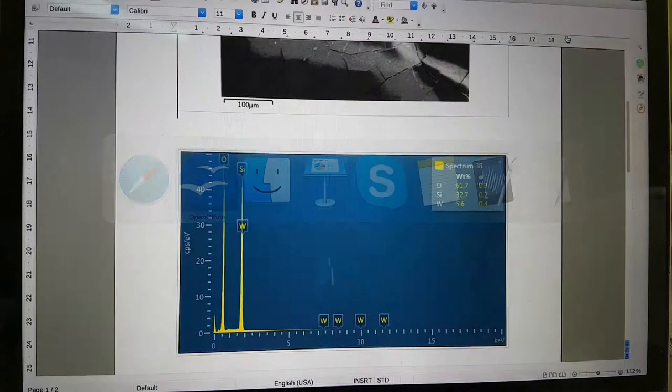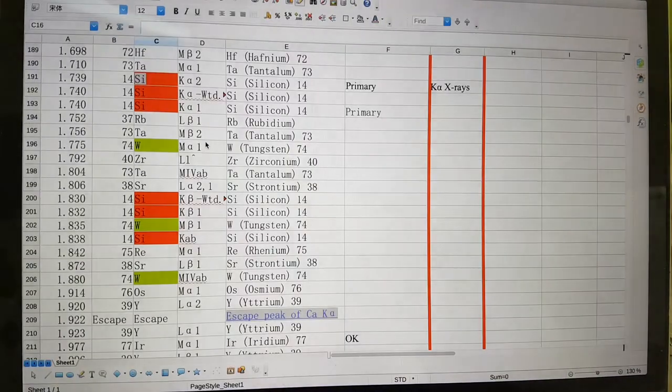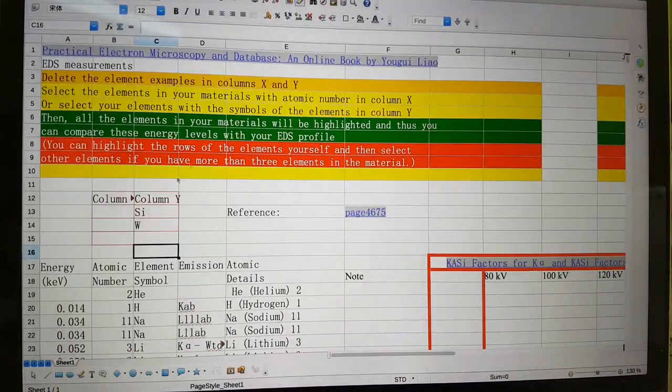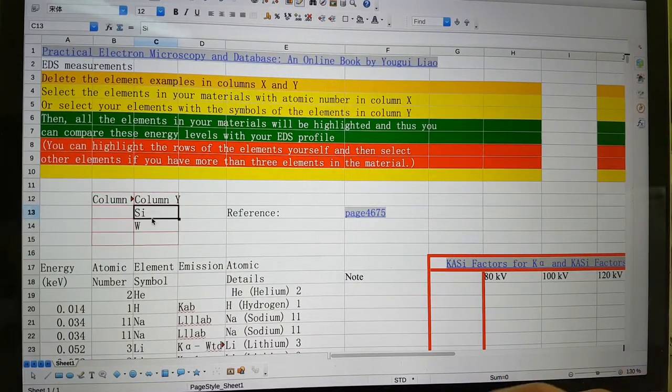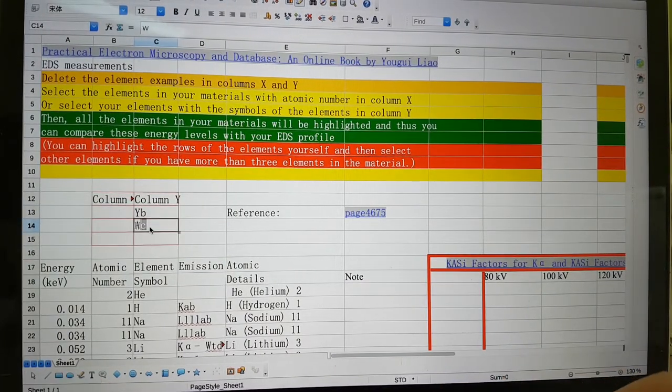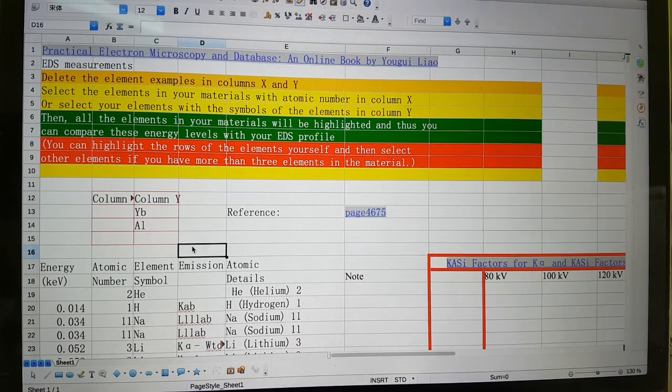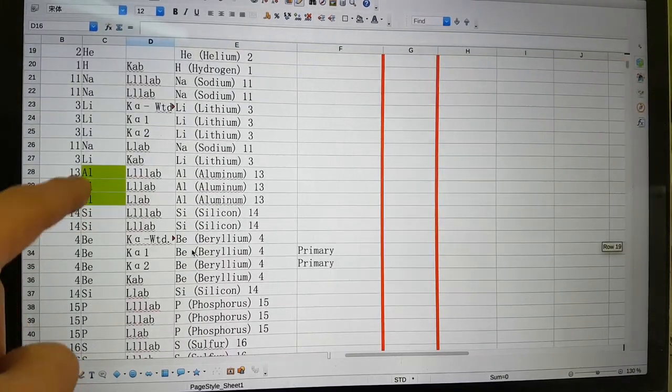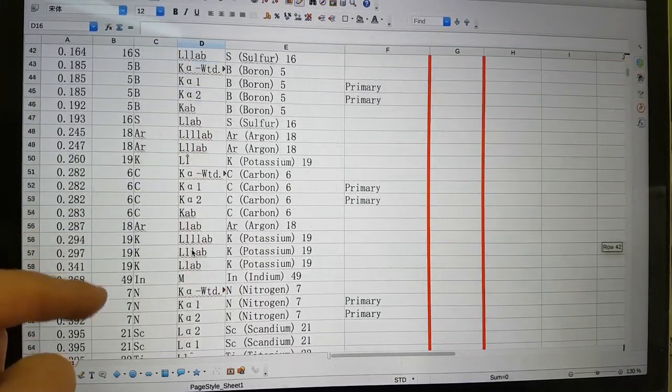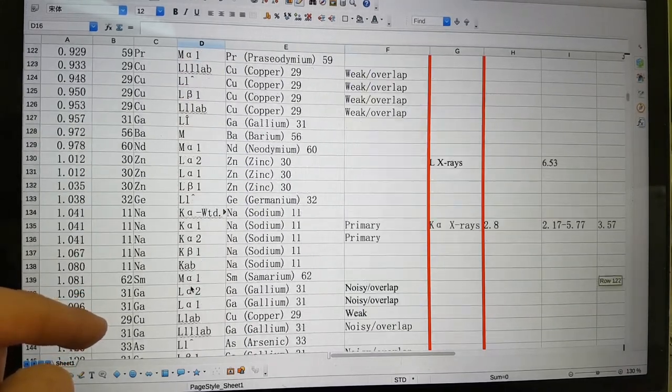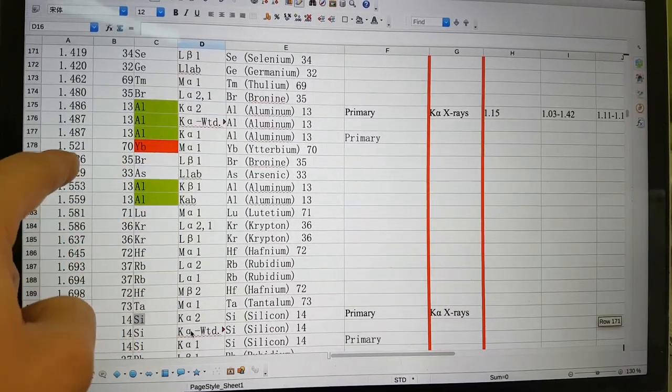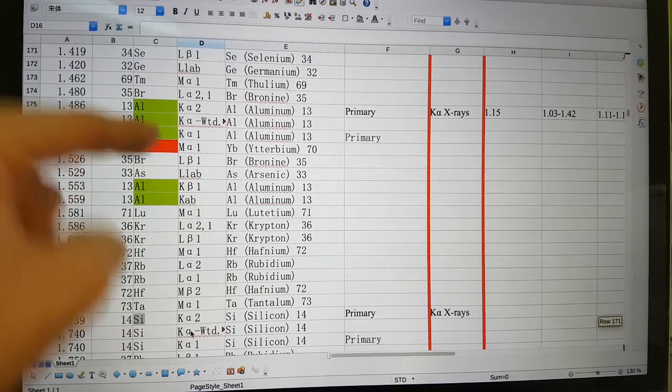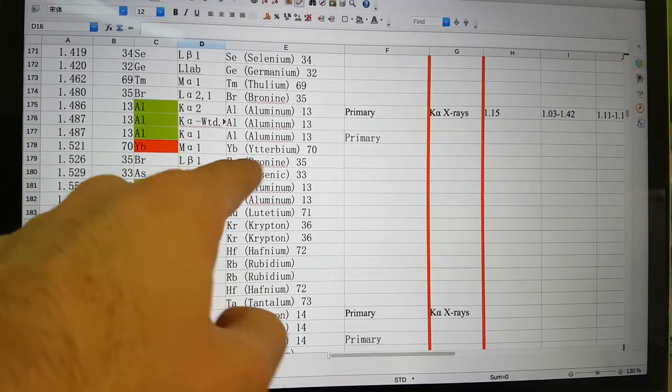Now, looking at the other thing that we had here, if we go and type in ytterbium, so we go ytterbium and aluminum here, you can see there's no conflict at this low energy. But if we go up, here we go. So there's this problem right here with aluminum and ytterbium. There's a bit of a crossover peak here.